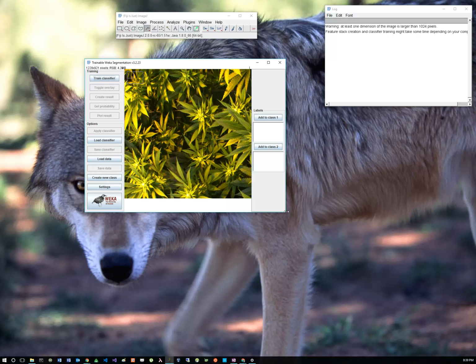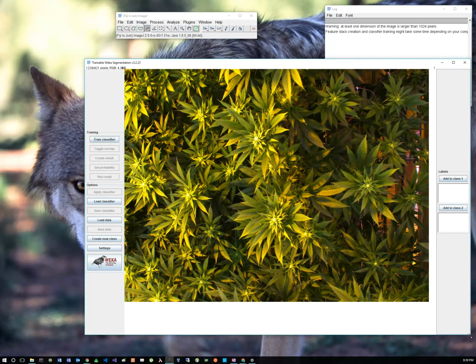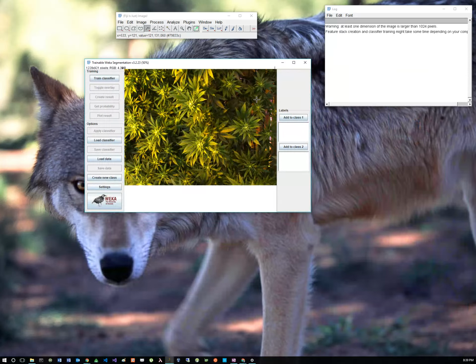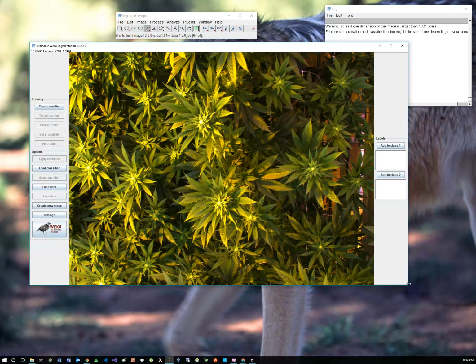Now, to navigate this window and annotate successfully, you need to resize it in such a way so that the entire image is visible. Alternatively, it's possible to zoom in and zoom out by clicking on plus or minus key on your keyboard. So let's resize our image.